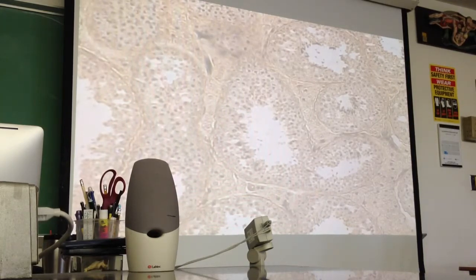So, more information than everyone needs to know probably, but I just think it's so cool. And you're just seeing the detail up here, so a little extra on that one. Okay.